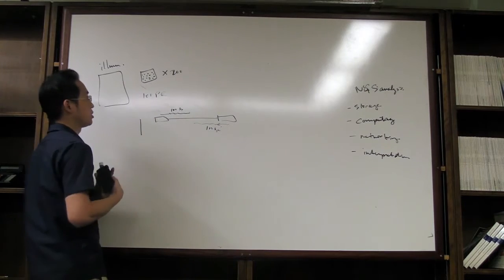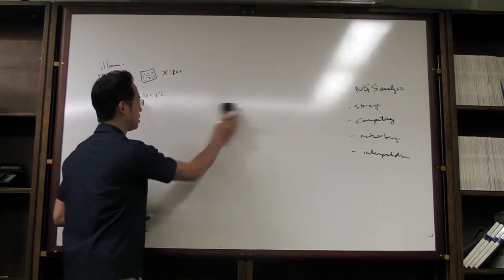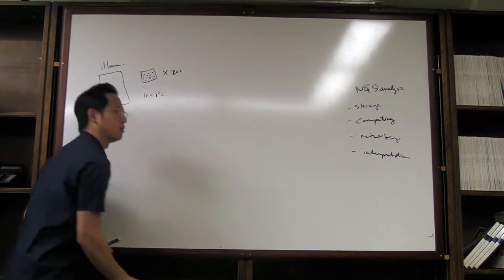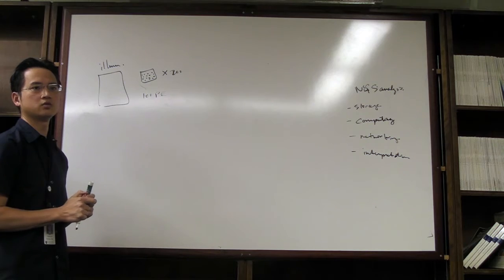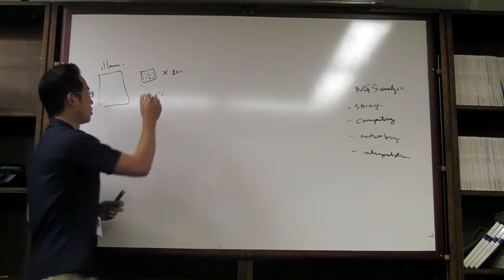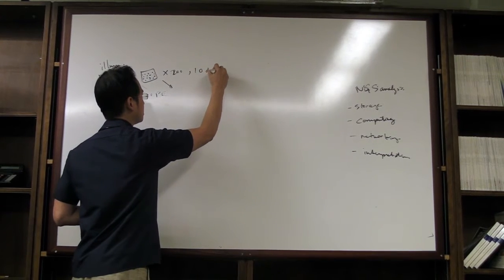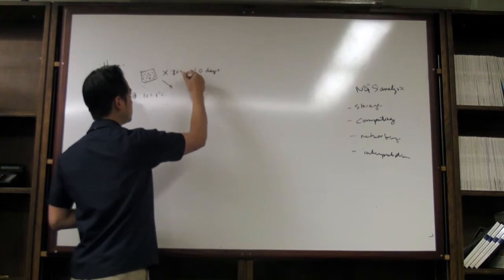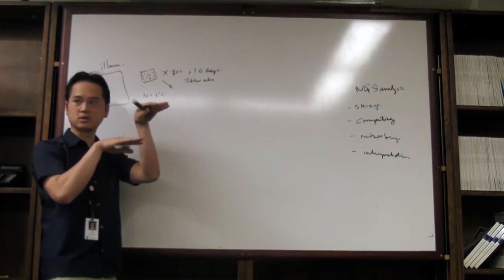So what you do is you capture all of these images, and I don't think there's enough computing power that... I don't know if it really analyzes in real time. I forget the strategy, but at any rate, if you were to store all of these images, it takes over 10 days, I think from 2 flow cells. So remember, HiSeq 2000 has 2 flow cells going.